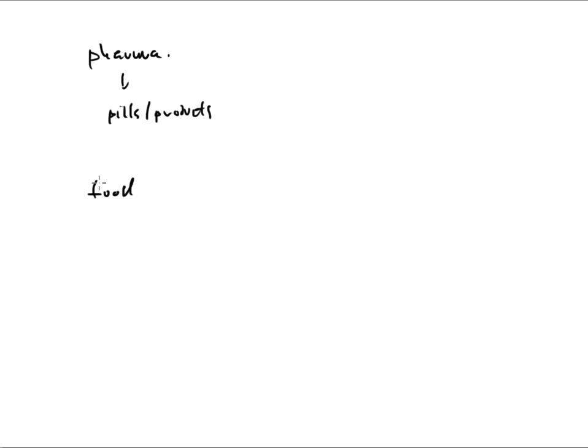Food, all of the products that you'll be using today are probably food related. This is another test that food companies often will use, and the reason is because moisture, just like in pharma, moisture can set up bacteria growth. It can start to decompose these products. So food will also often use LODs as well, and these could be anything from flours to cereals.